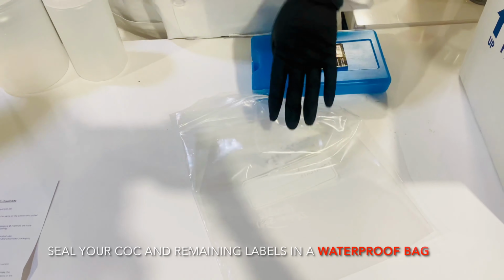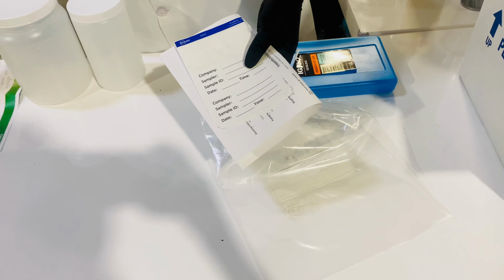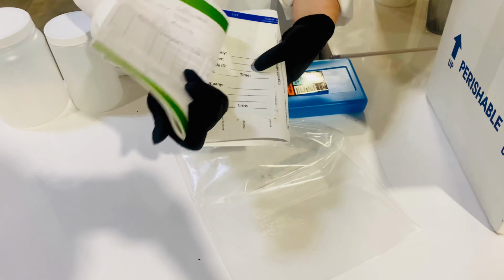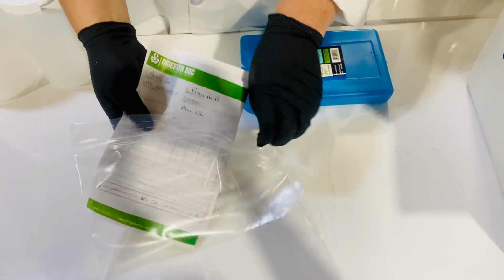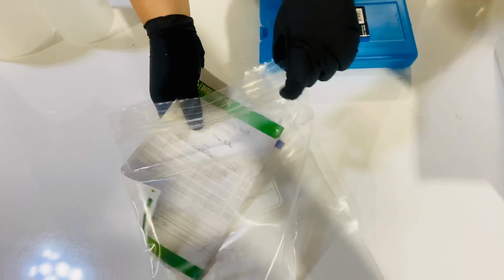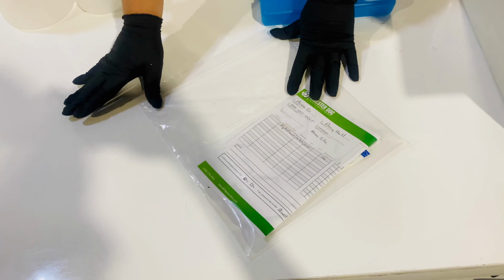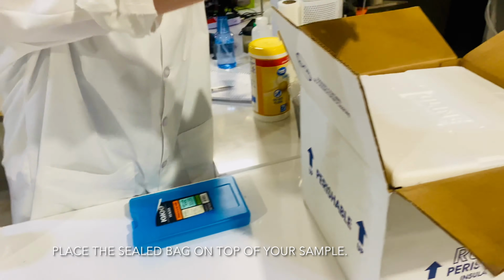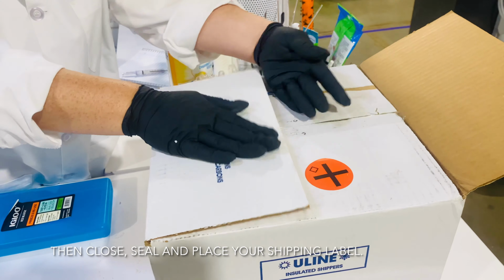One more important step, always include your chain of custody form inside a Ziploc bag within your package. This ensures that your form stays dry and we have all the information we need to properly input your sample into our system. Place the sealed chain of custody on top of your package. Then close, seal, and place your shipping label.